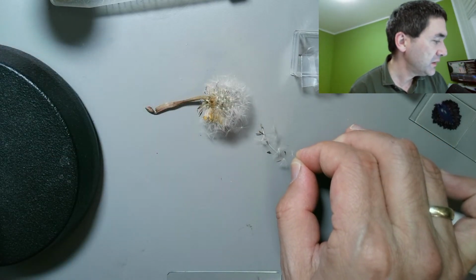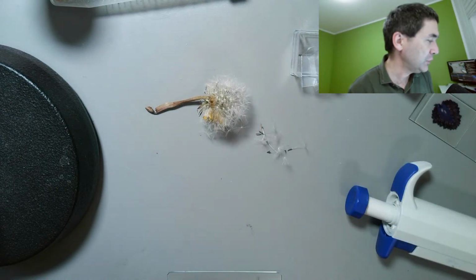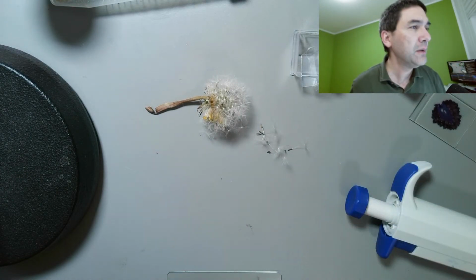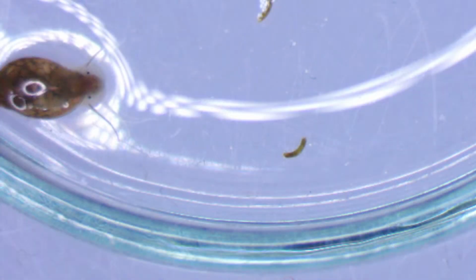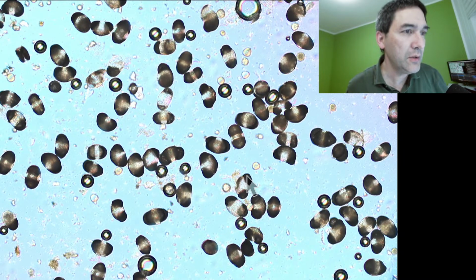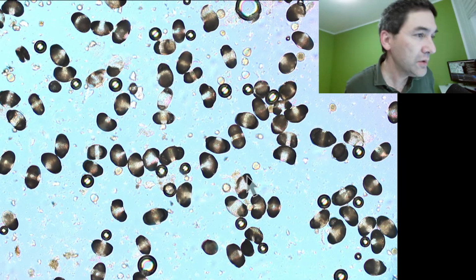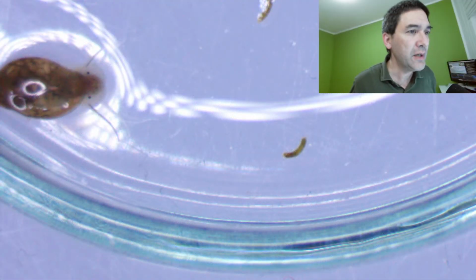I mean, the snails. This one snail has actually already escaped. So I'm going to pick up the snail. Let me quickly switch over to the... here. That's one. This one also has frozen. It's kind of weird. There seems to be an issue here. This one over here also has frozen, but maybe I'm going to deactivate it and activate it again.